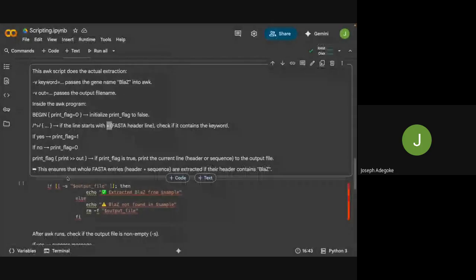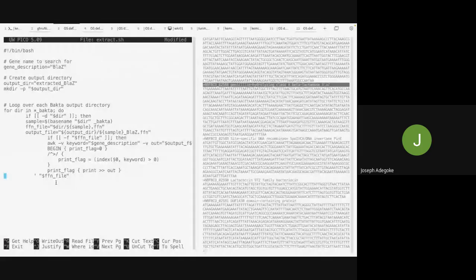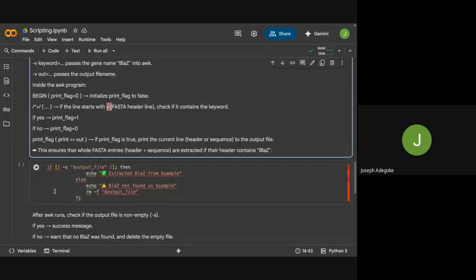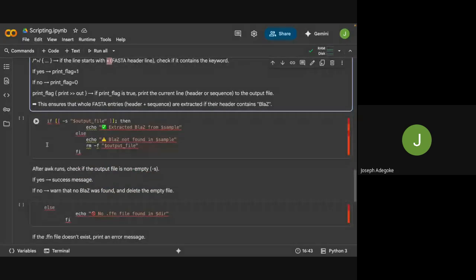So the next thing is to close all these if statements. If I run it like this, it will work, but it's going to be expecting other conditional statements you want me to do. But if we don't close them, it's just going to skip and continue to work. But before we even close, the next thing is that we want to print out an error message, or want it to echo, okay, yes, our sample is working, our script is working.